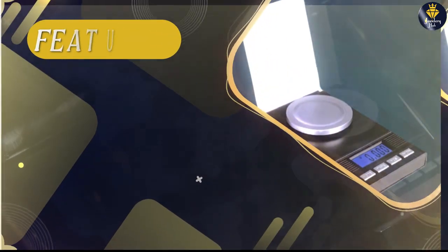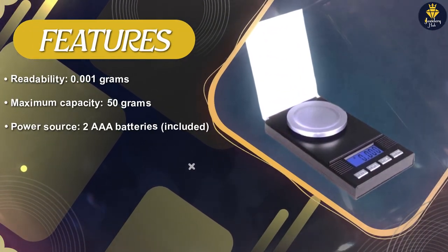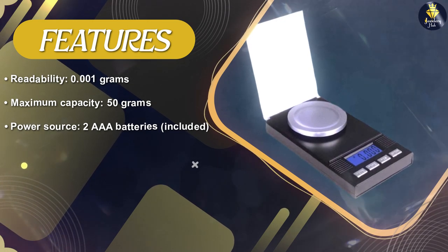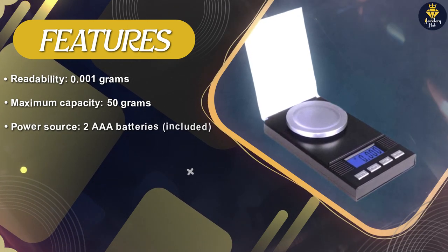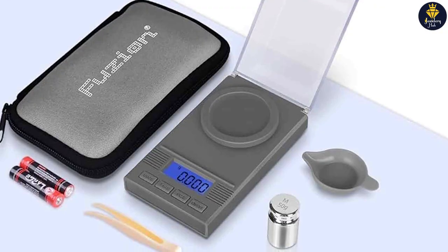Another useful feature of the Fusion PL50 is its protective cover, which not only shields the weighing surface from dust and debris but also doubles as a weighing tray. This tray ensures stability during weighing and can be easily removed for cleaning or storage.